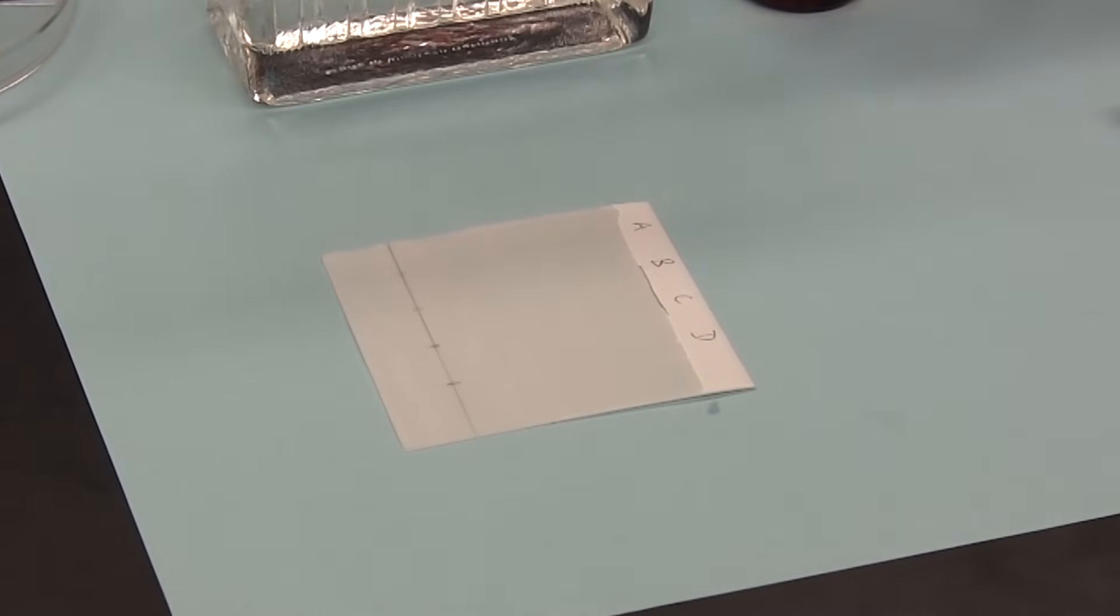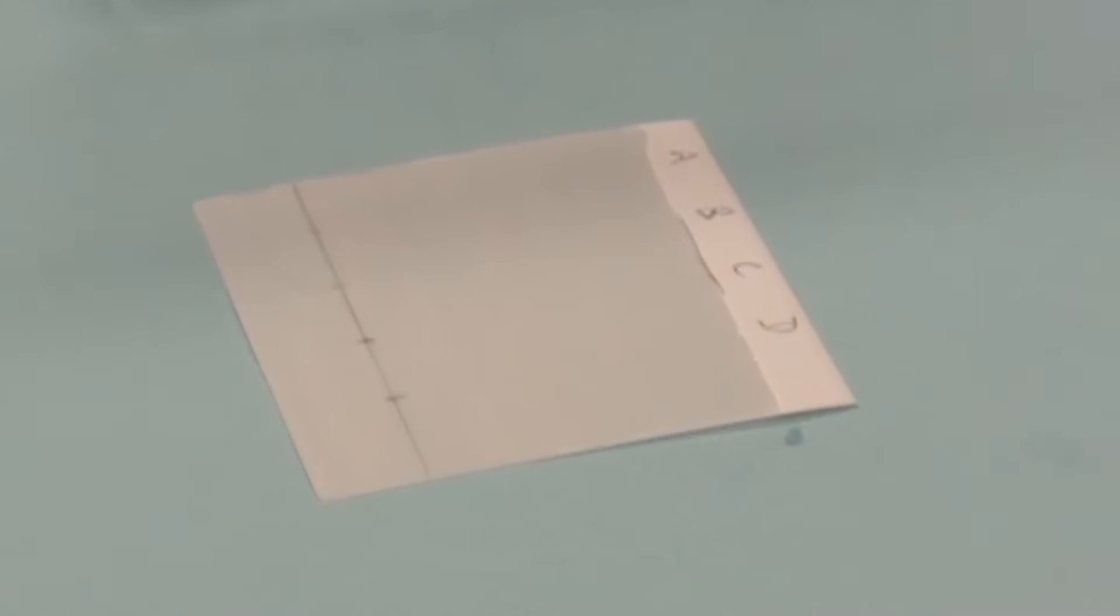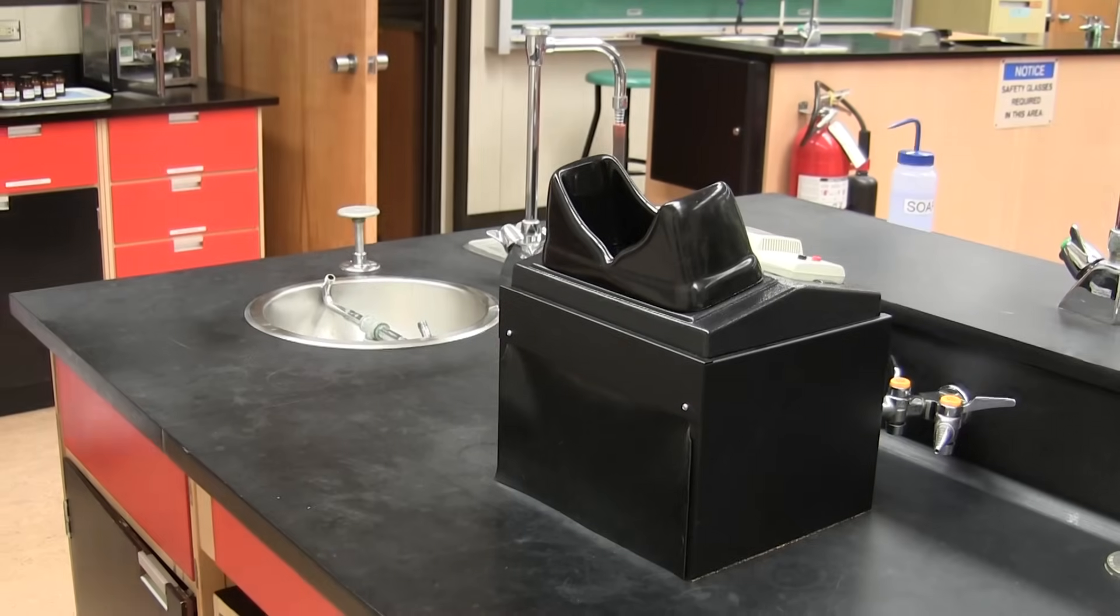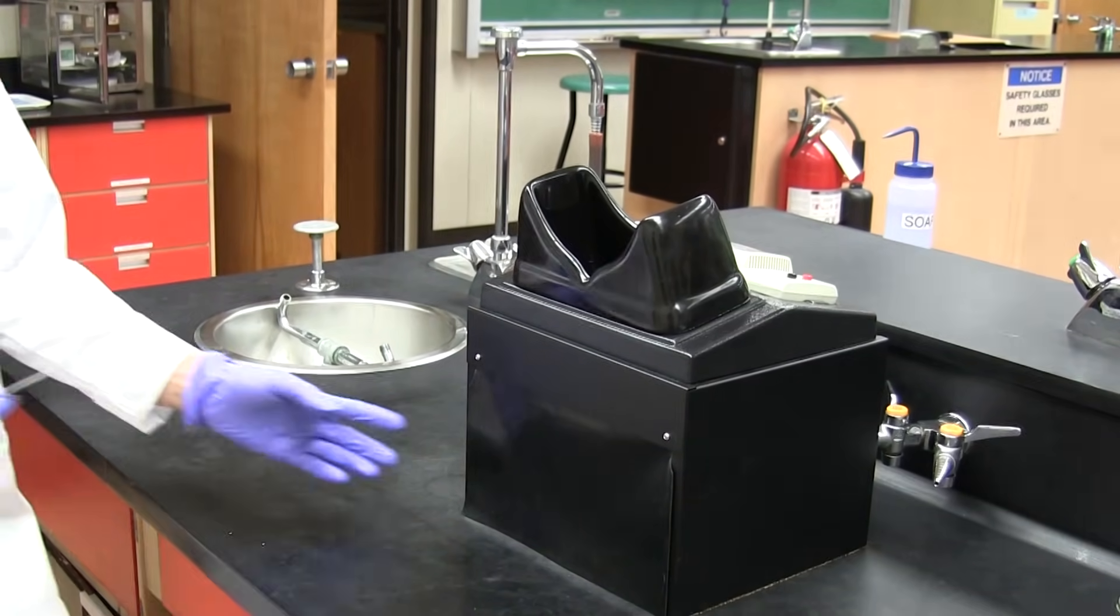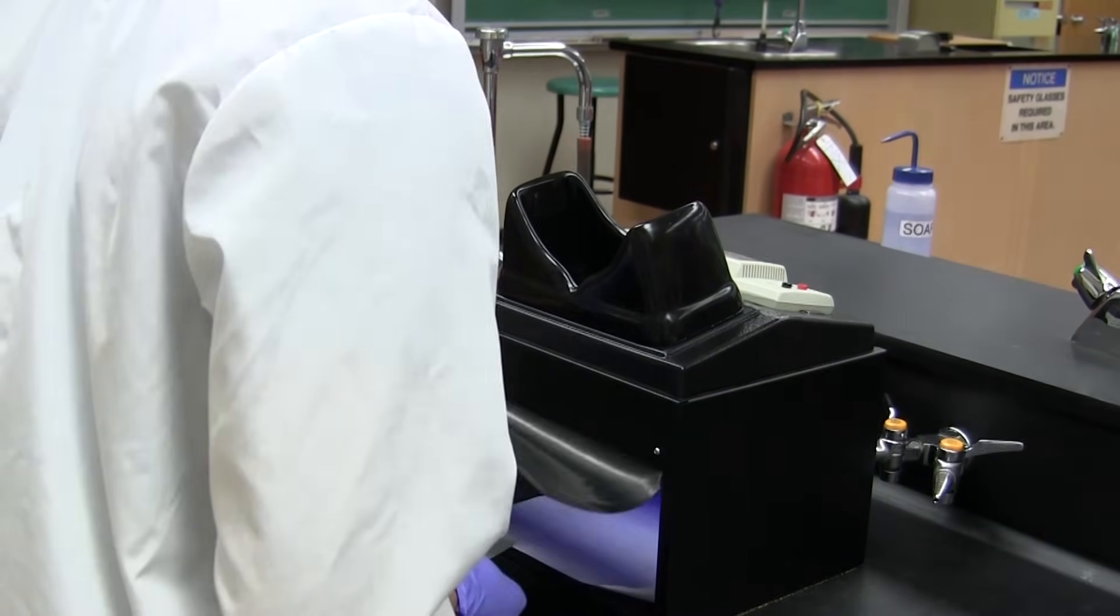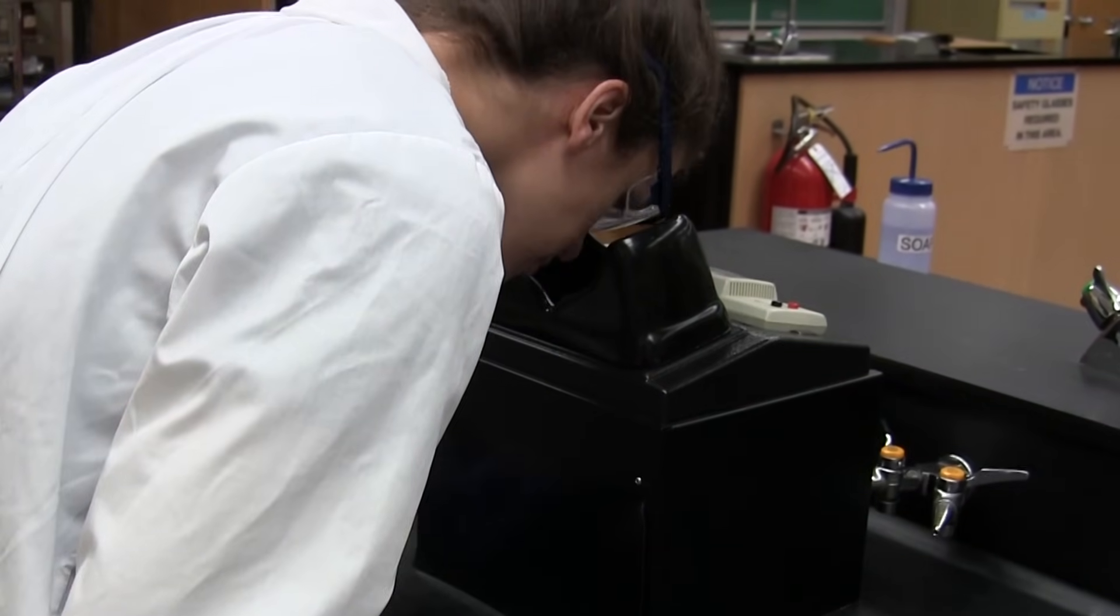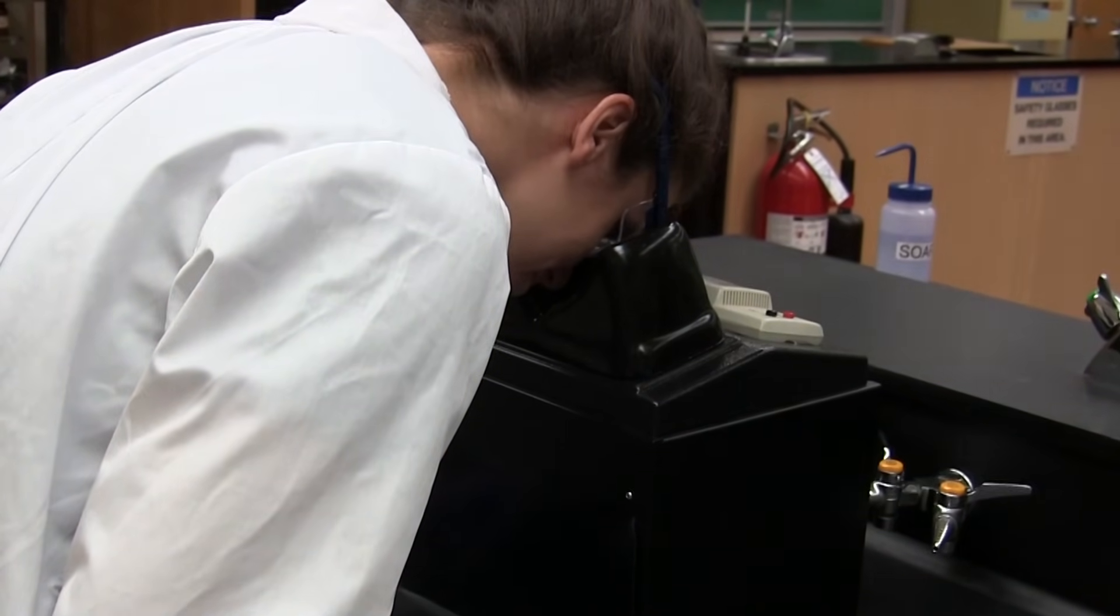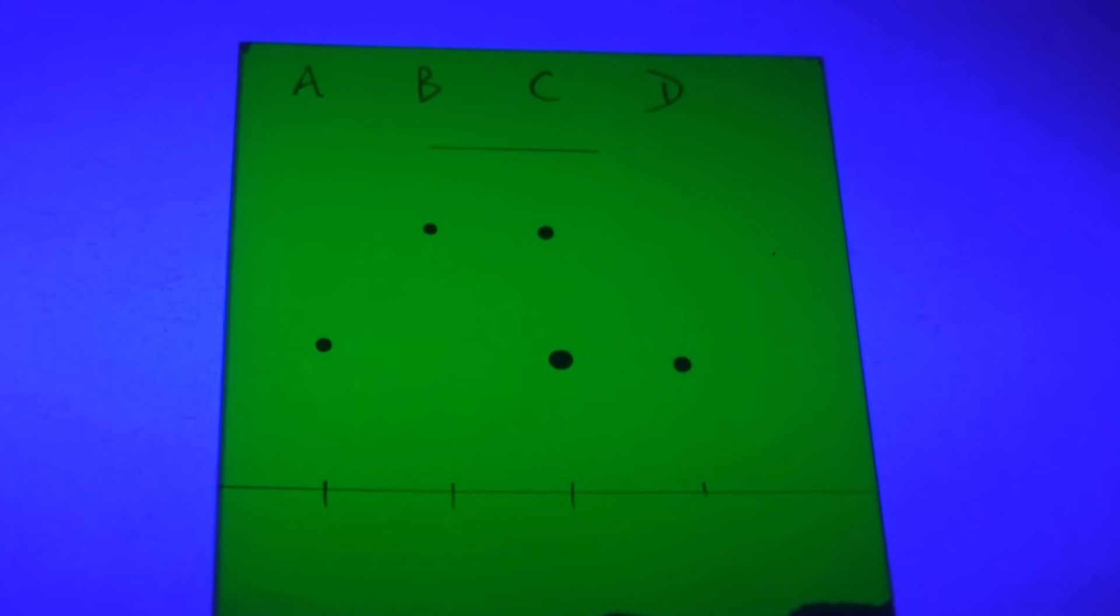There are a number of ways to see or as we say visualize developed TLC plates. A common method is to place the developed plate underneath an ultraviolet or UV light source. This method of visualization is by far the most common in your lab. If a fluorescent indicator is added to the silica, the silica will fluoresce under UV light.